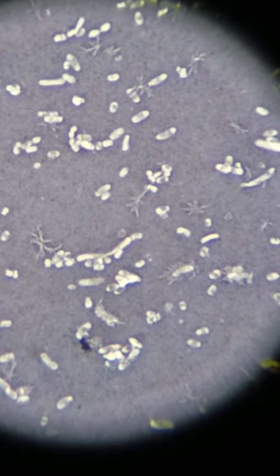So if you look, you can see that this is what we call a bacillus, but in some of these you can see that in the center there is a little darkened structure. That's probably some inclusion.